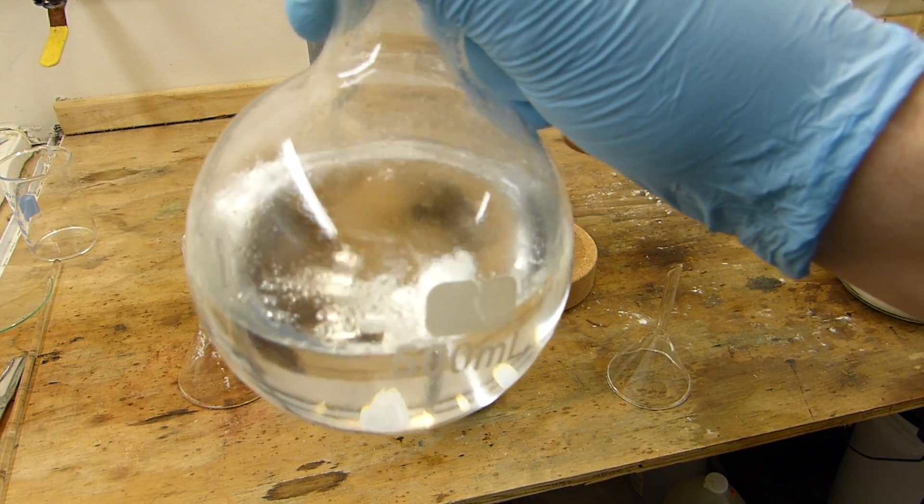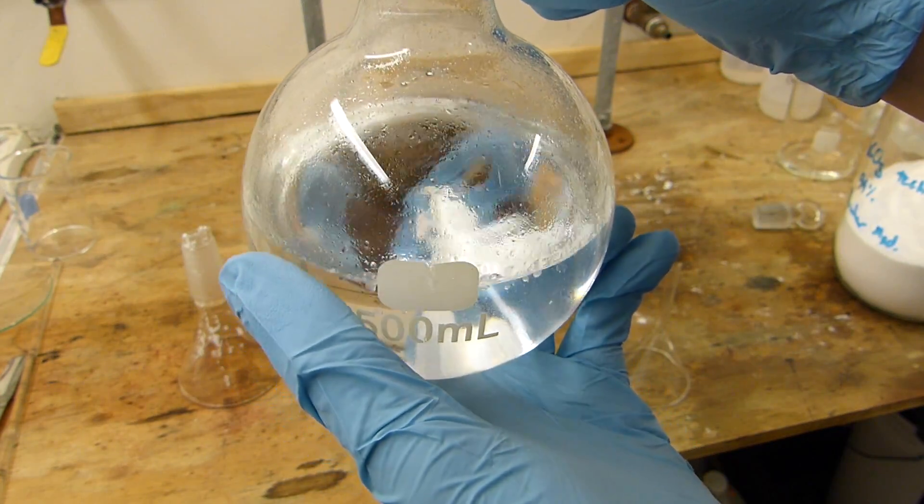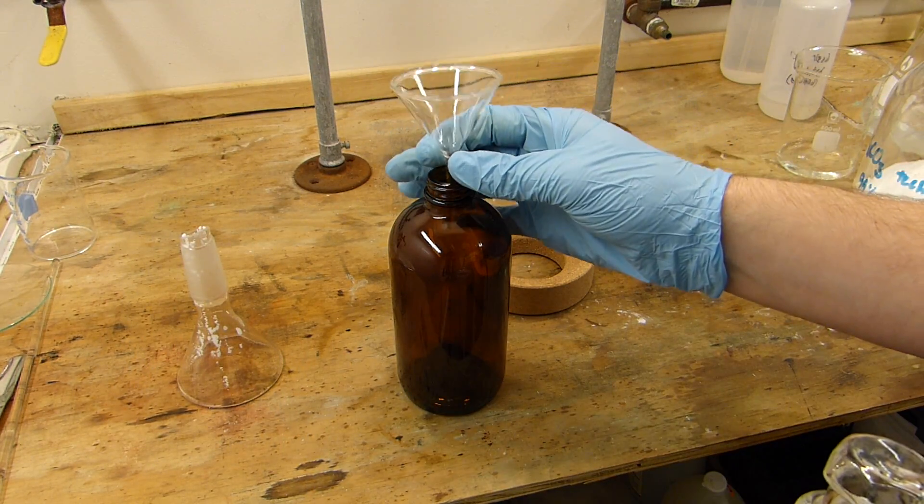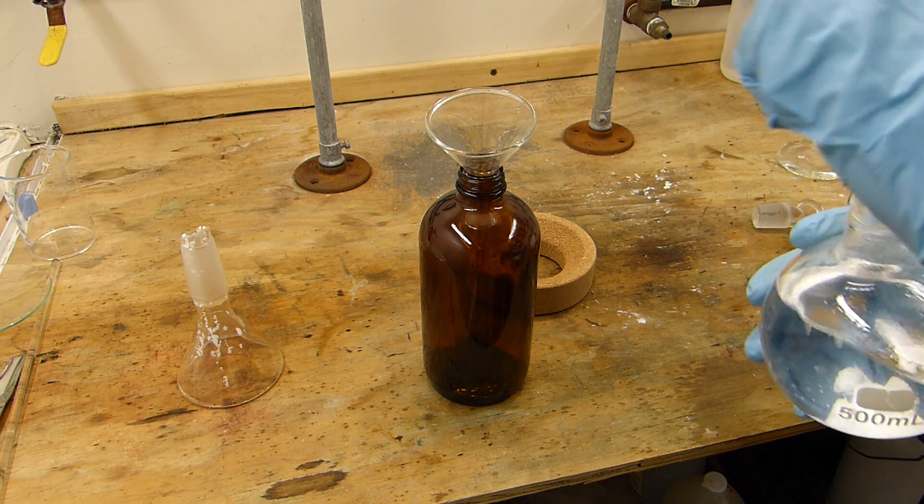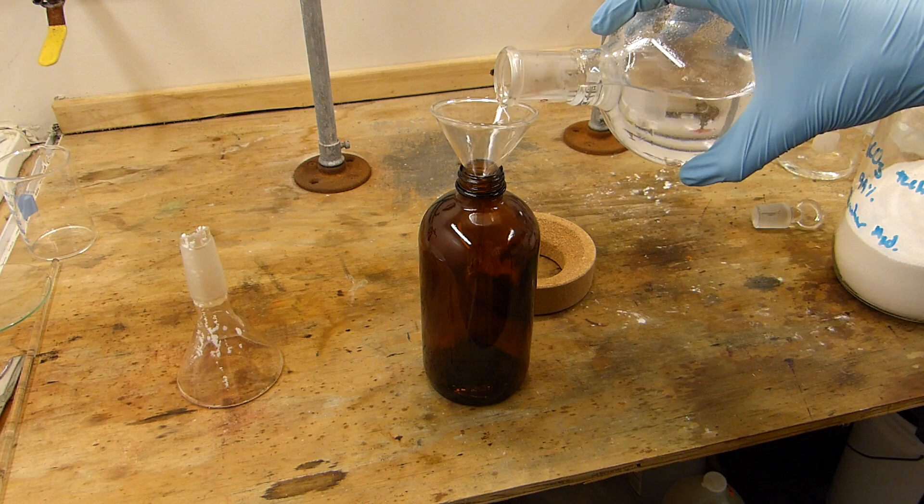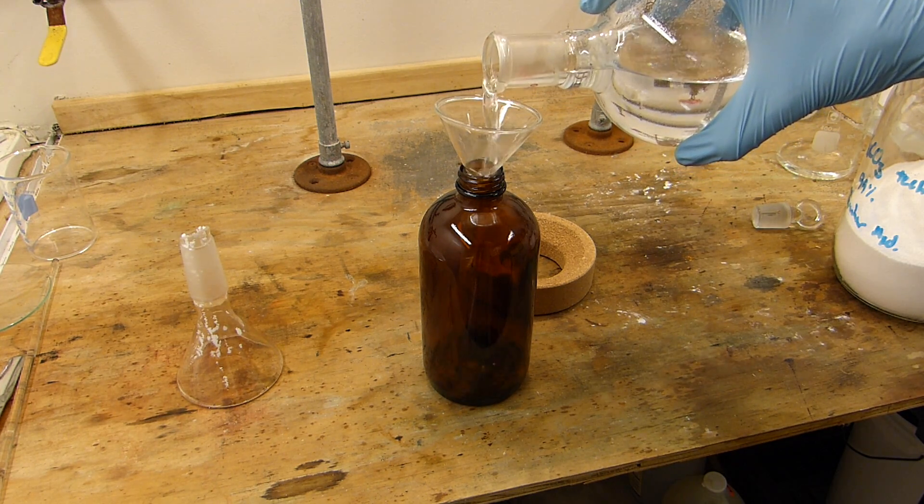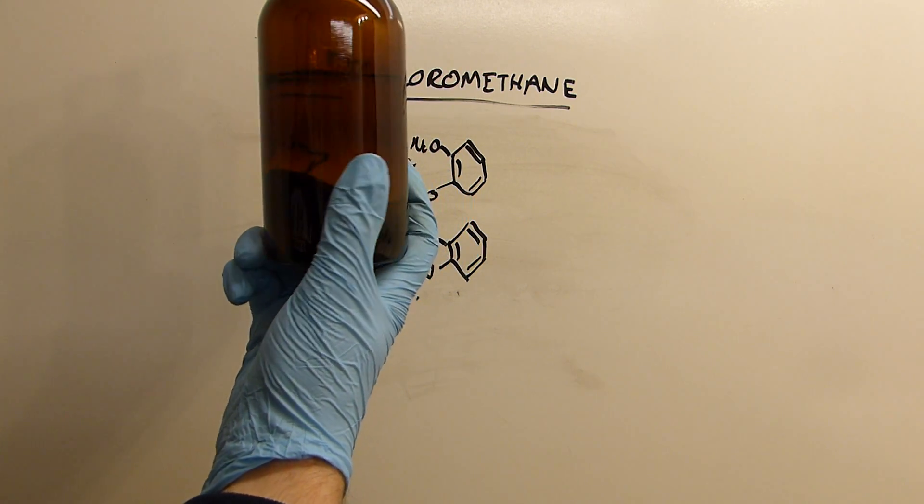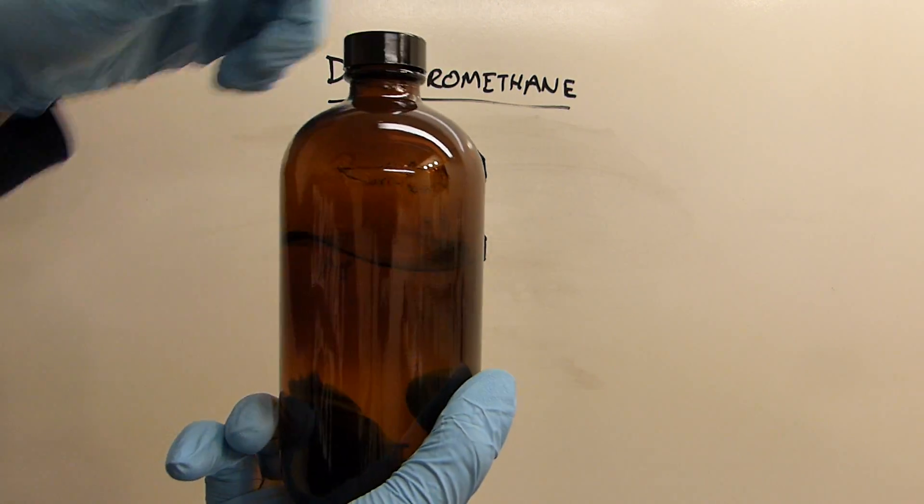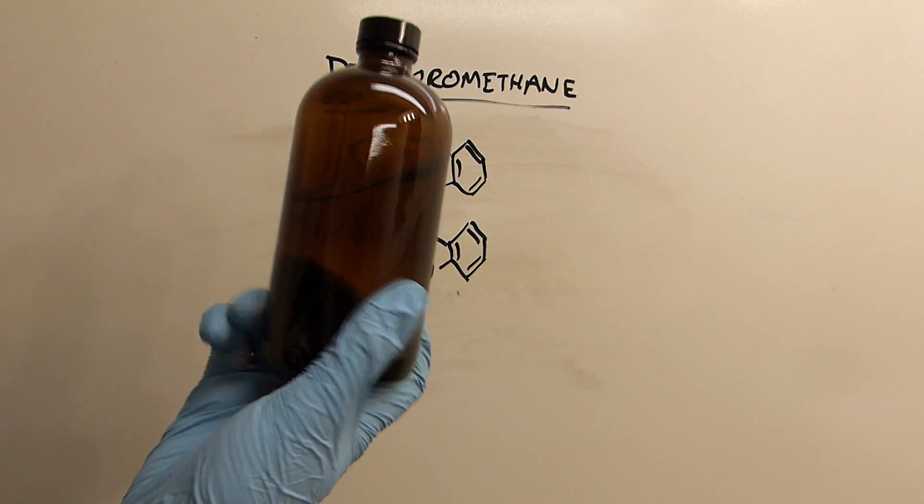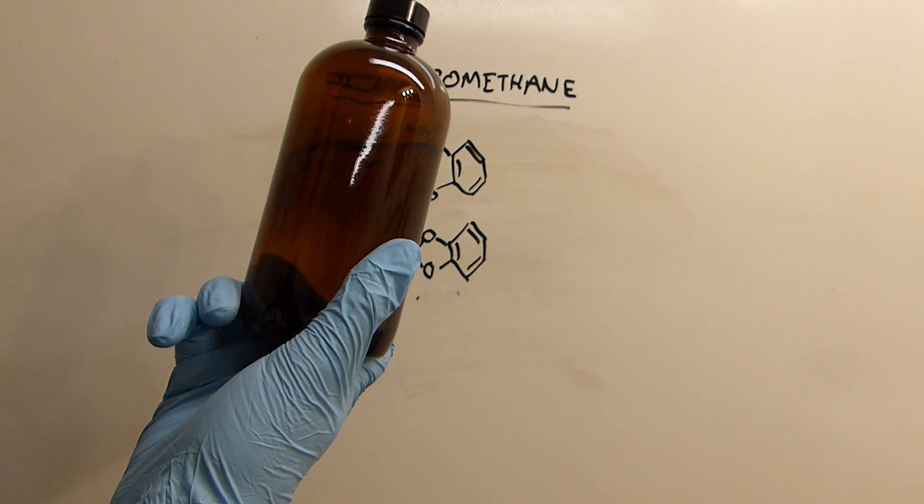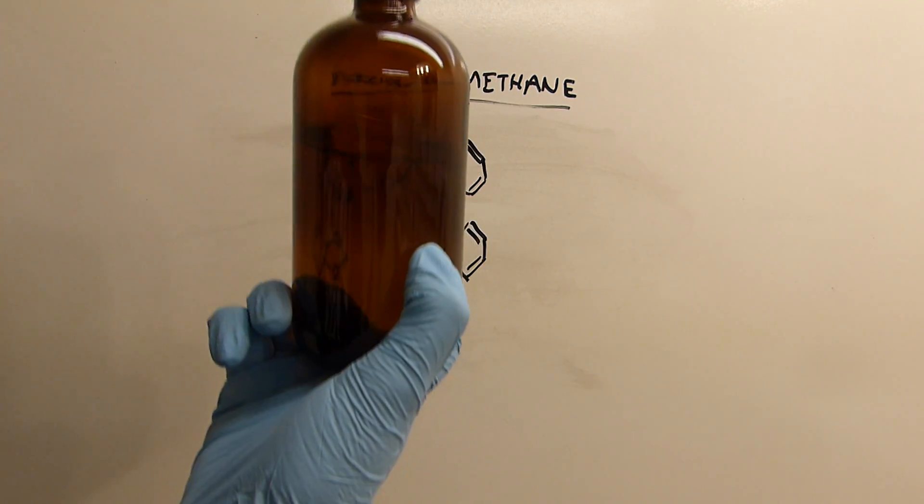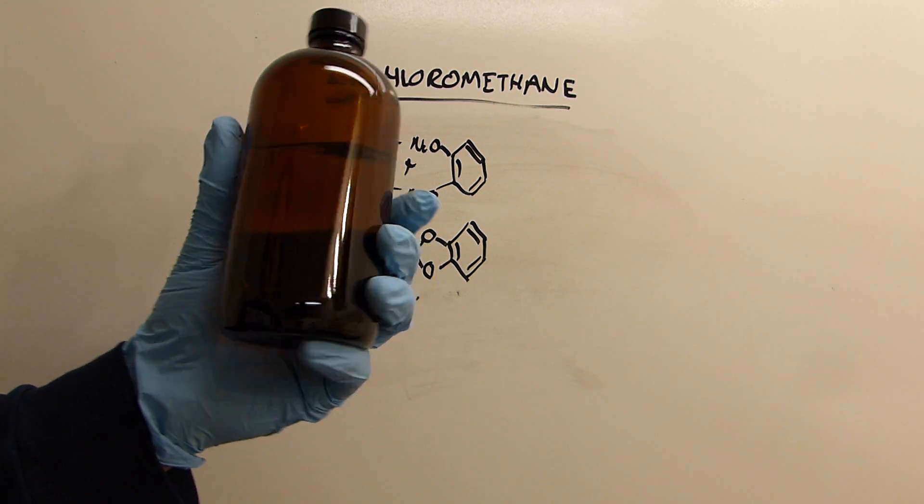All right, so here's the final product—about 350 milliliters of dried dichloromethane. I'm just going to simply pour this into the storage bottle, being careful not to get any of the desiccant in there. So here's the product of the evening's work: about 350 milliliters of dichloromethane that is pure enough for 99% of the uses you'll need dichloromethane for. If you need dichloromethane that's more pure than this you'd probably distill the stuff that you purchased anyway, so there's really no sense in repurifying this by distilling. It's really just a waste of time.